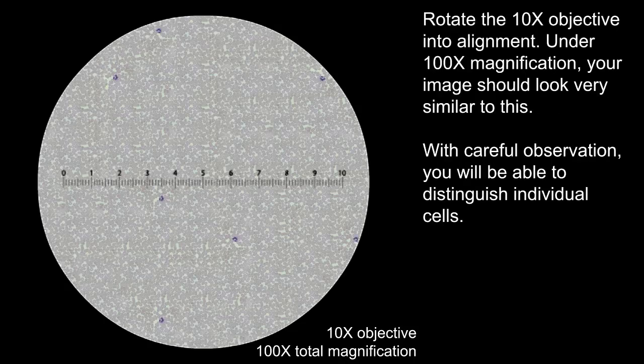Rotate the 10x objective into alignment. Under 100x magnification, your image should look very similar to this. With careful observation, you will be able to distinguish individual cells.